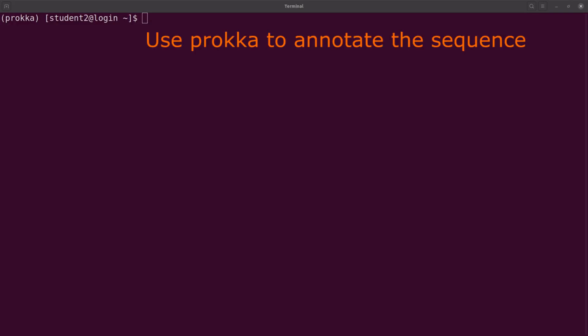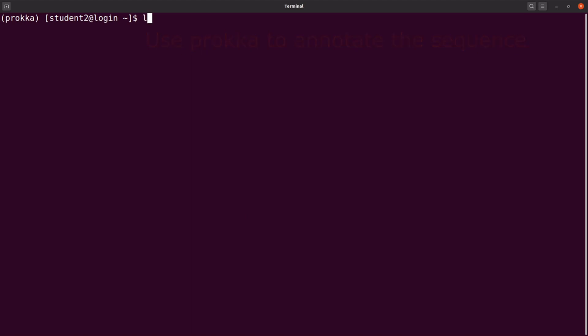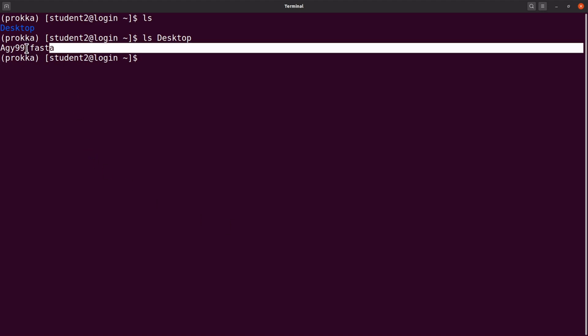So we are on the terminal. Let's quickly explore the file we downloaded first. I will say ls. The file is on my desktop, so I will say ls desktop and this is the file.